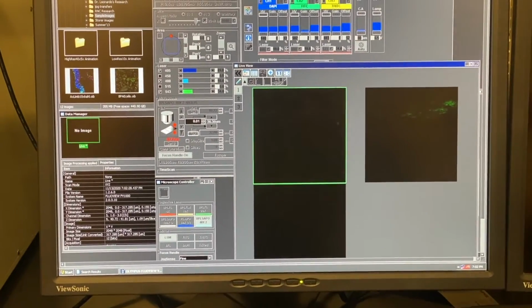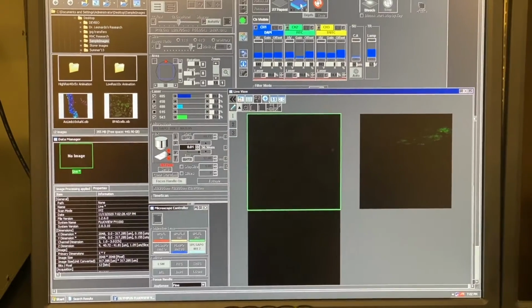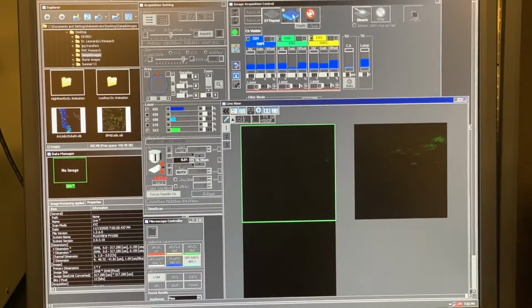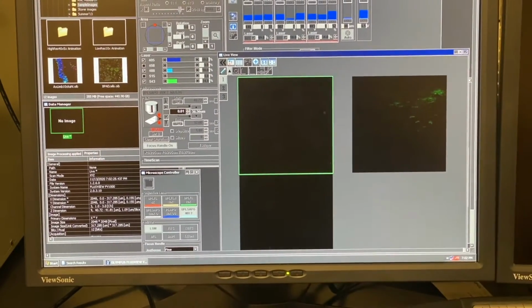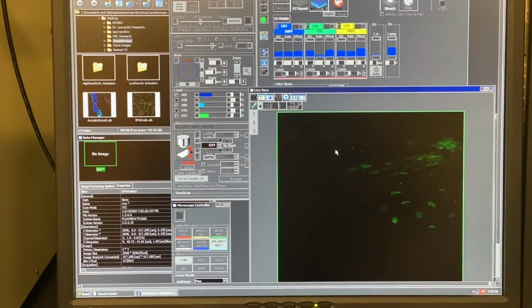There's no nucleus up there at the top, so it's not surprising that where our knife cut the tissue section, we're not going to see much blue. But as we go down to the next layer, and the next layer, and the next layer of these cells, we'll be able to see all the different colors. So let's go ahead and make this one large and overlay all the colors.